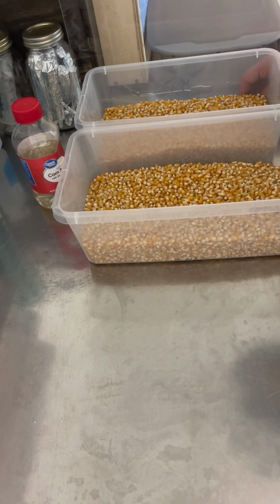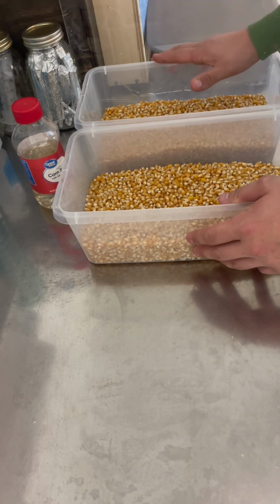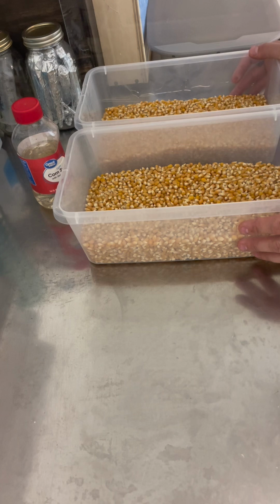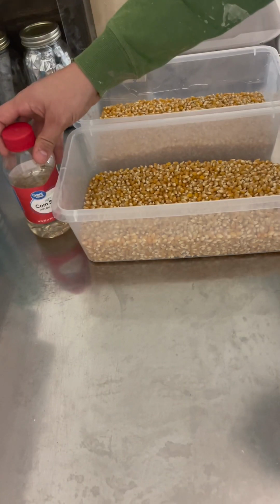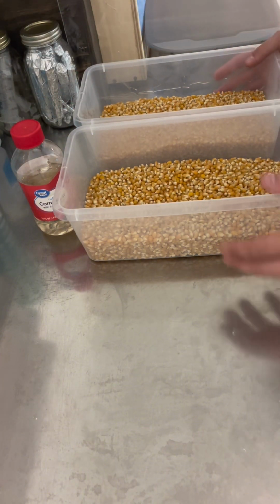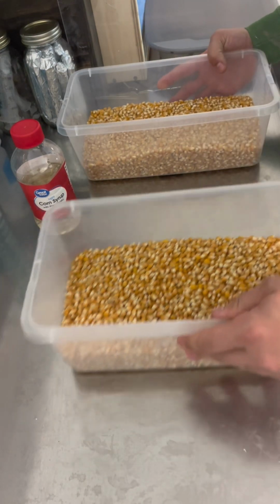But yeah, I'm sure you guys can see by the thumbnail of the video that we're going to be doing a side-by-side of regular corn for mushroom spawn and drippy corn for mushroom spawn. I'm going to try and do everything exactly the same, other than in 7 of the jars there will be corn syrup in it, and in 7 of the jars there won't be. I already weighed out the corn, so this is exactly 4 pounds. This is exactly 4 pounds to the point.